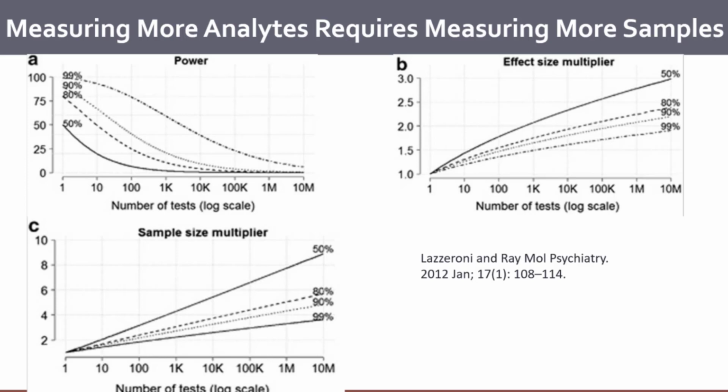And I just want to make sure that everybody's very clear, because everybody says, well, I can measure more things by DDA in a TMT experiment, but I can only measure 10 samples, right? But the key thing is, if you're going to be measuring 30,000 or 40,000 things, you need to be thinking about hundreds, if not thousands, of samples often in order to be correctly powered.